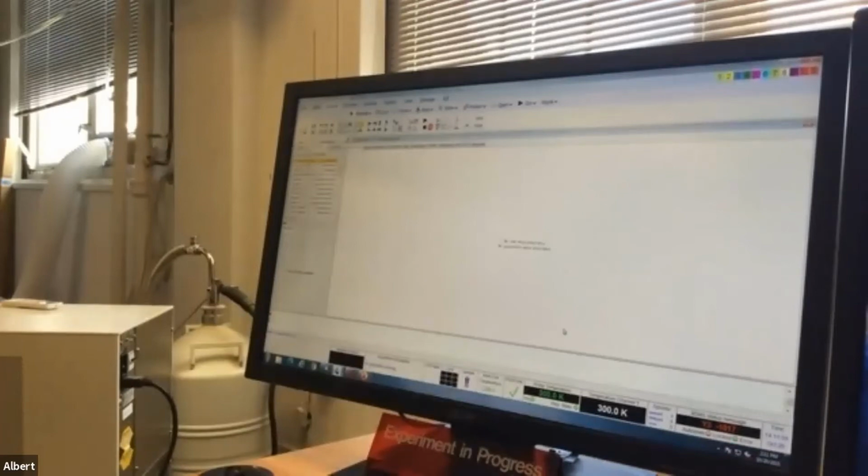All right, anybody have any questions while we are running the second sample? But what I want to show you with the crude is what the actual sample looks like when it's not pure and when it has leftover salicylic acid. So we're going to see that.